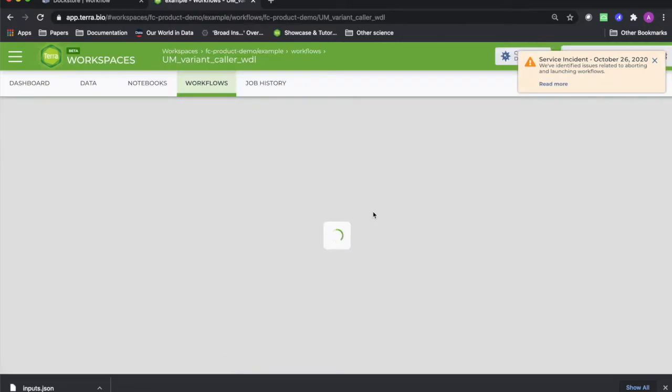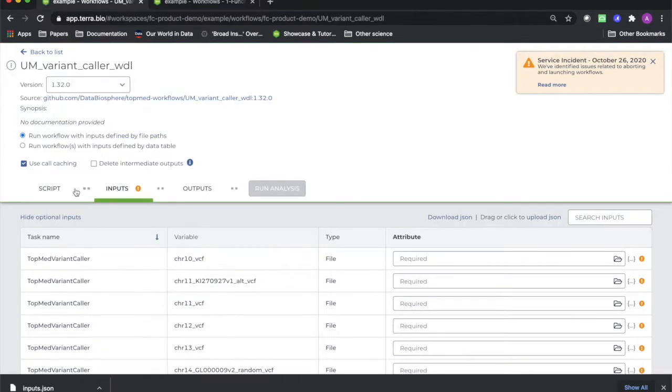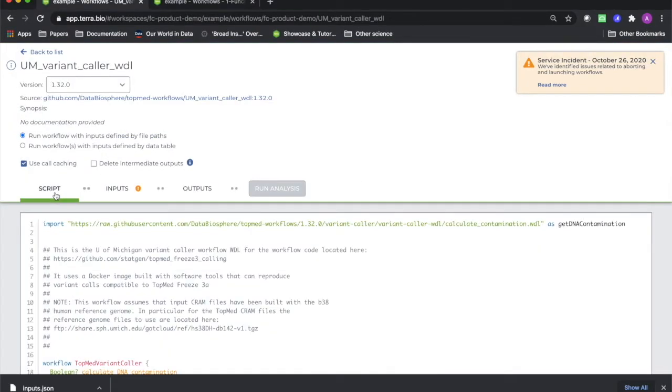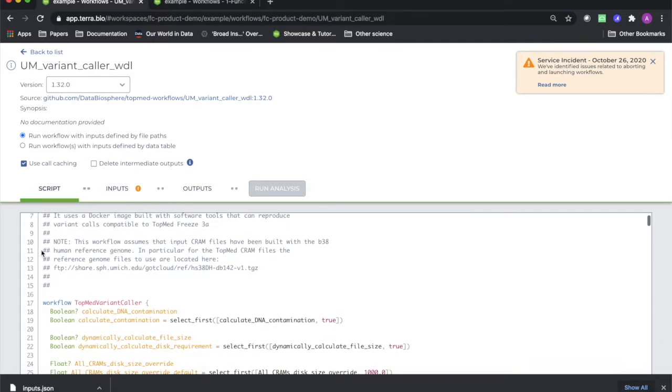In addition to the offerings to be found on the Doc Store, you can also upload and publish your own workflow description language, also known as WDL script, files to our repository.